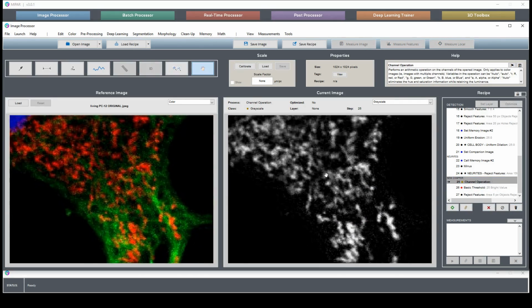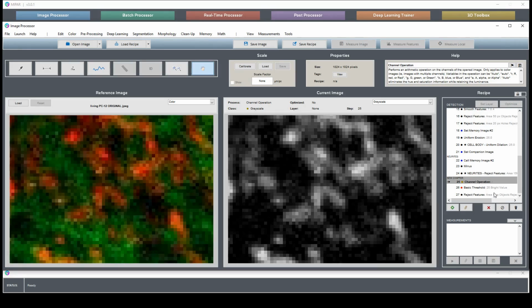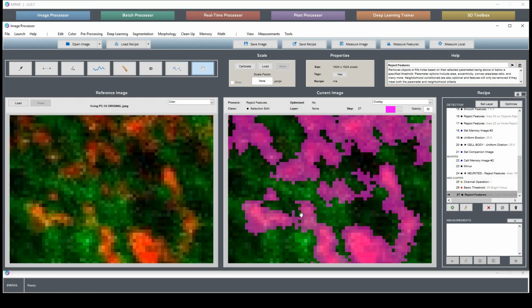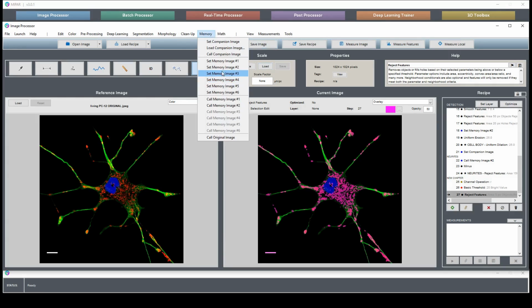We have our best guess of what the mitochondria are here. And this best guess, put out by the microscope itself, and then with a little bit of JPEG compression, does include some of this messy edge. If we were to go in afterwards and change that, just because it doesn't look pretty to us, the cell doesn't care, biology doesn't care. This is the most accurate representation that we have. So we're going to stick with it. So we save this away.